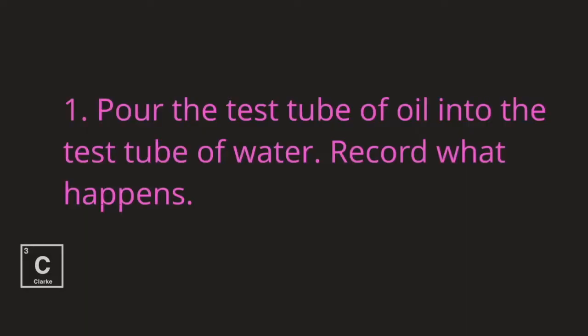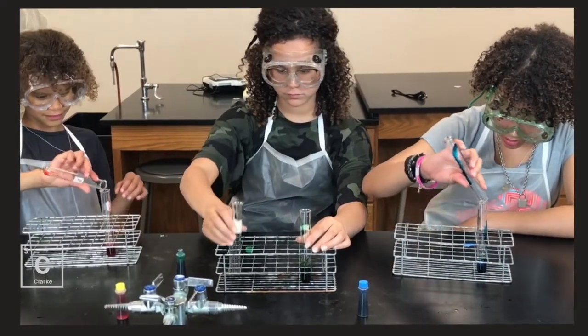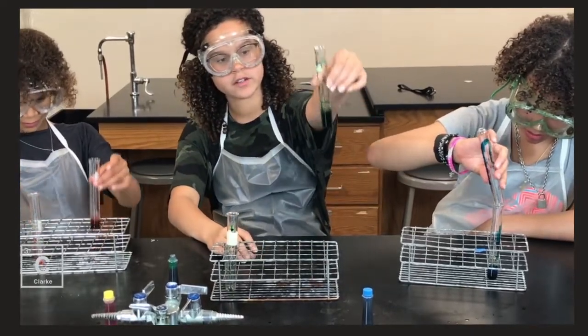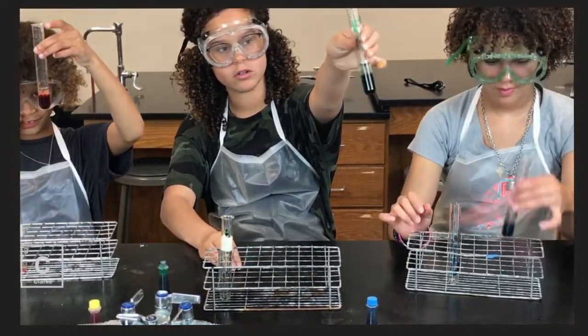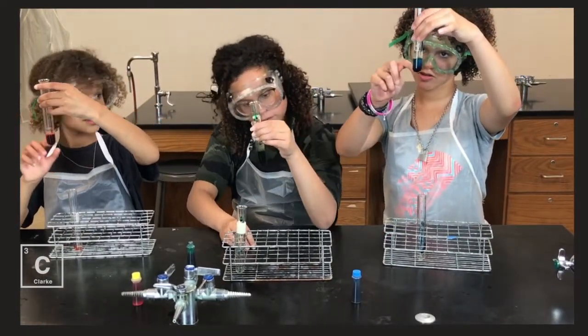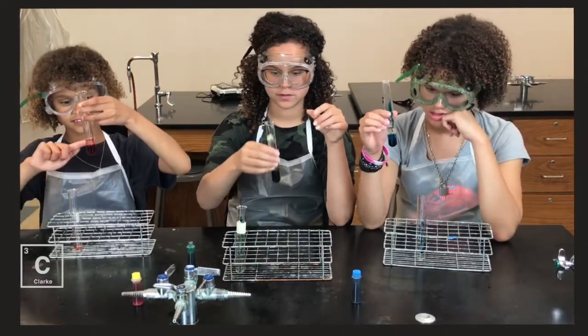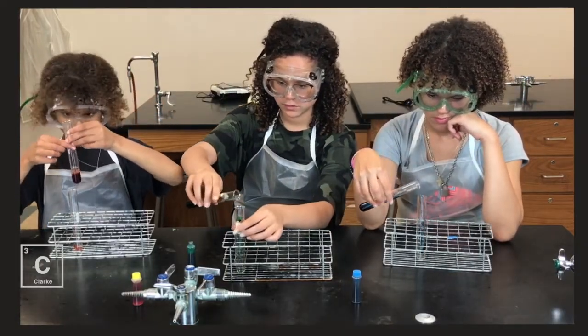Pour the test tube of oil into the test tube of water. Record what happens. Can you show it to me? There's like layers. Like the water and oil doesn't want to mix. It's like a purple at the bottom kind of. And then it's like light and then it's the oil. Let's see what happens when you pour that whole thing into the other test tube.